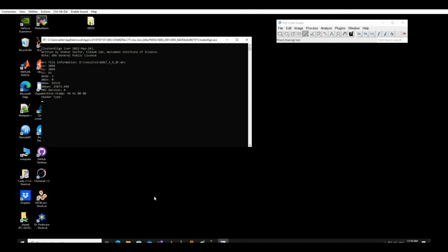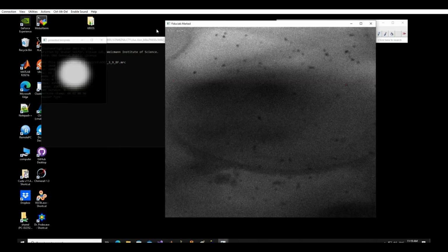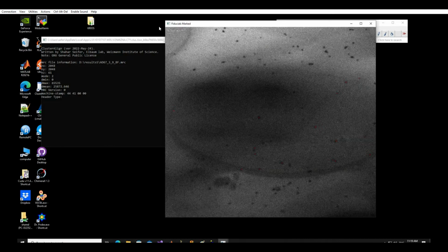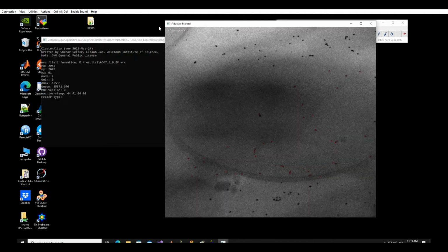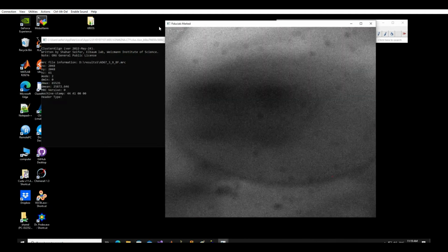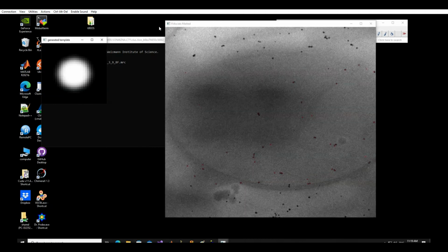The software detects the particles and tracks their locations based on recognition of clusters of points that rotate as rigid bodies. The particles are clustered based on a common height in the sample. The purpose of the cluster recognition is to track individual fiducials reliably. The image in the small window is a template formed from all candidate fiducial particles. The template is used to detect most reliably all the possible particles. On the large window, the detected particles are marked in red.